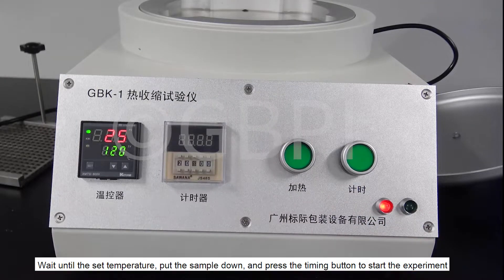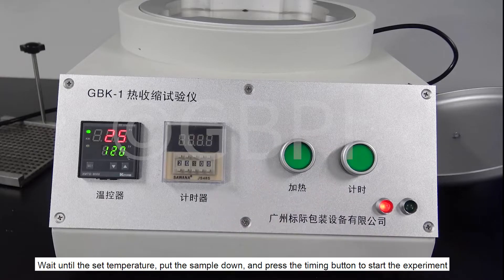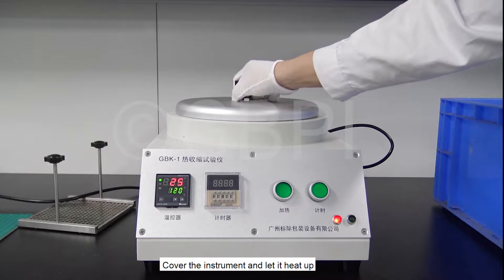Wait until the set temperature is reached, then put the sample down and press the timing button to start the experiment. Cover and let it heat up.